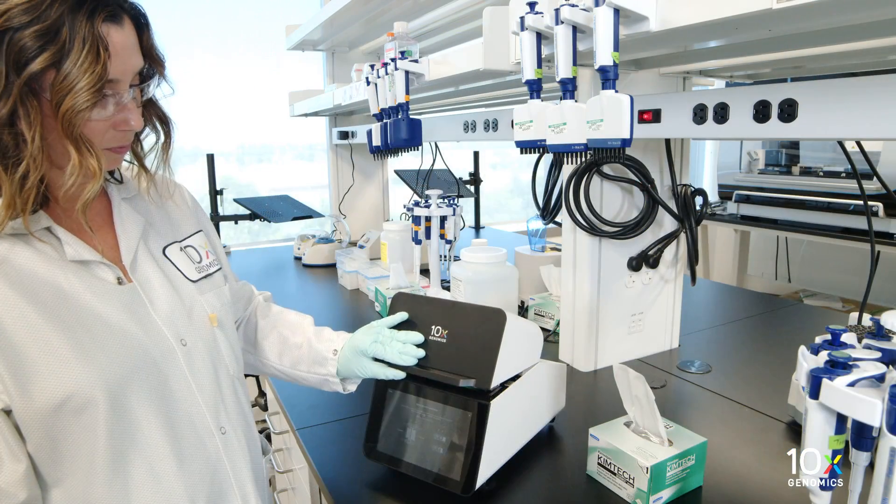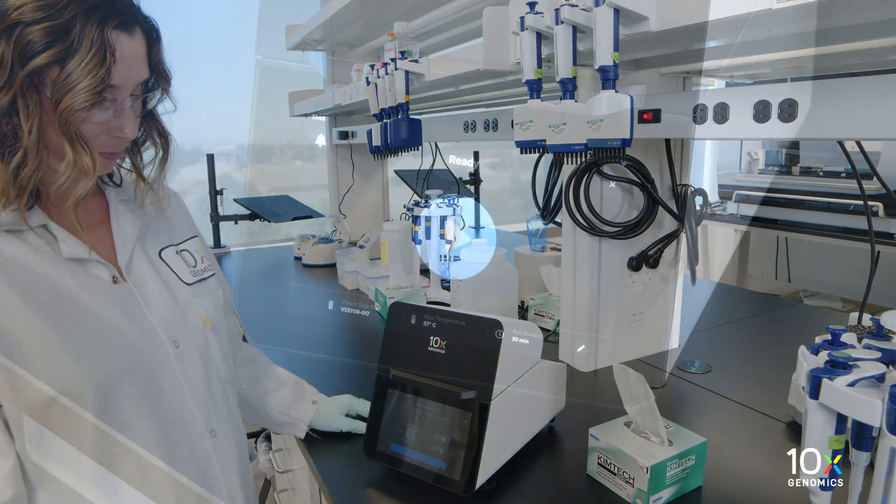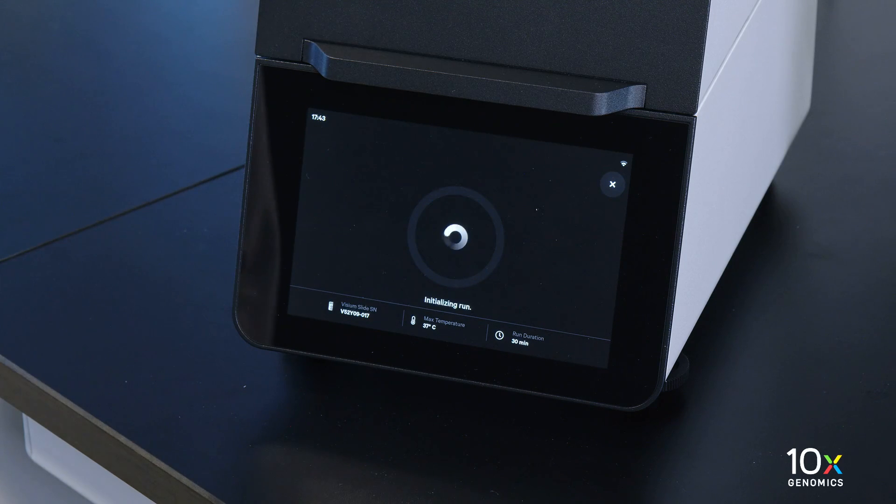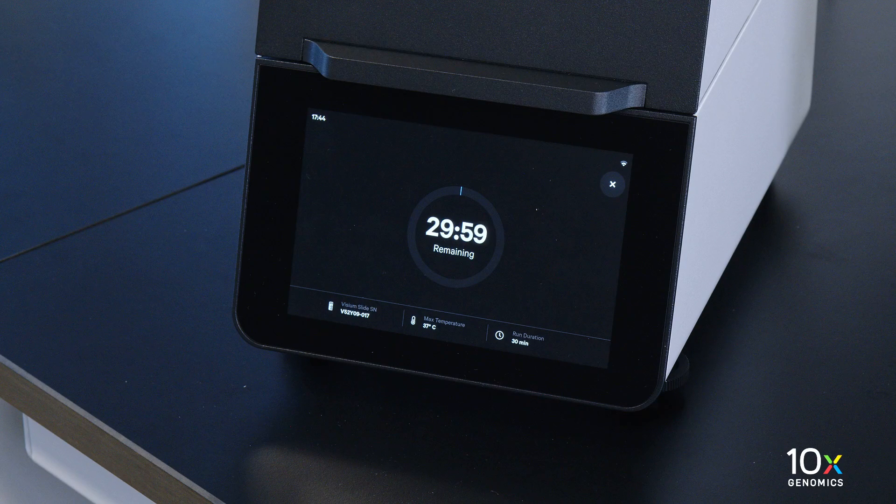Now we will run the Visium slide assist. Close the lid. The home screen will now display a play symbol and run information along the bottom of the screen. Press the play button to start the run. The run should take 30 minutes. The mid-run progress bar will show the time remaining in the run.